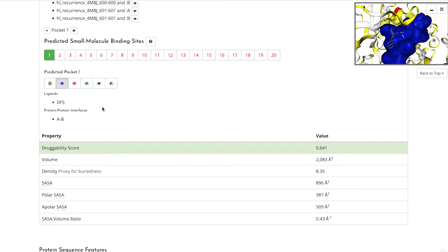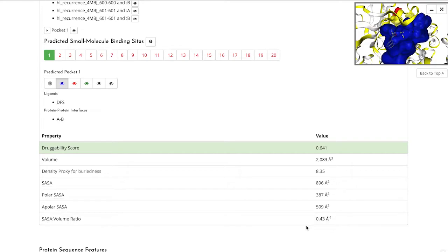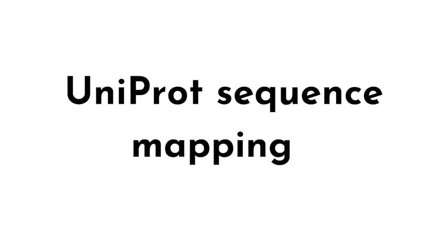These green highlighted binding sites are the most important ones, and this comes from the Druggability Score, which is determined from a number of factors within the pipeline. The other information we have includes the total volume of the pocket and the solvent accessibility surface area. This refers to the area of the pocket that is immediately in contact with the solvent.